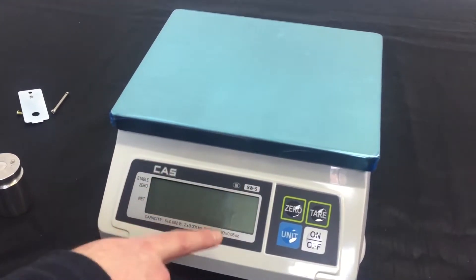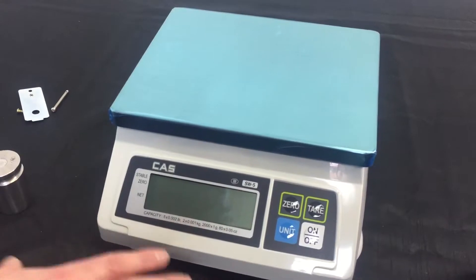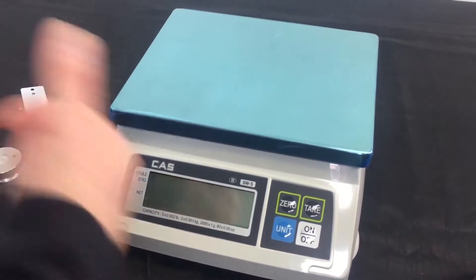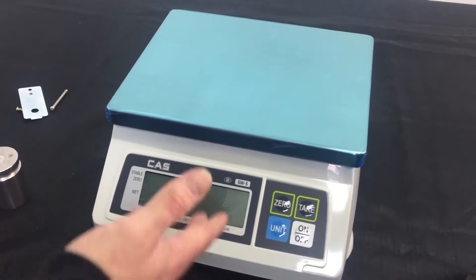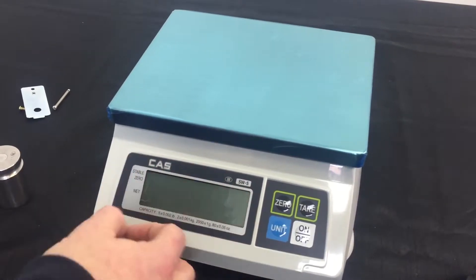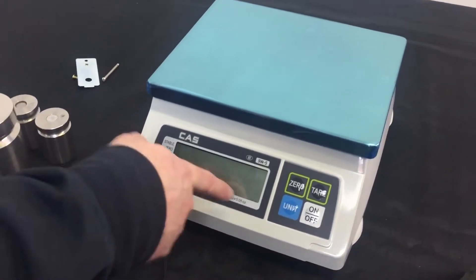Now, it says unit and one is flashing. One is for pounds, which is good. We want to calibrate in pounds today. Make sure that you know which type of scale you're working with to know whether it's kilograms or pounds. Zero is for kilograms. One is for pounds.